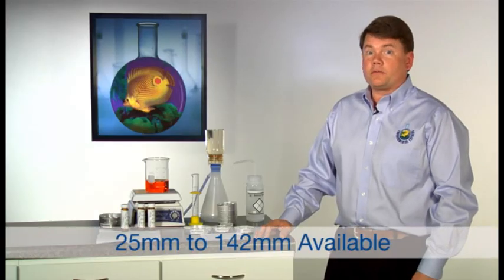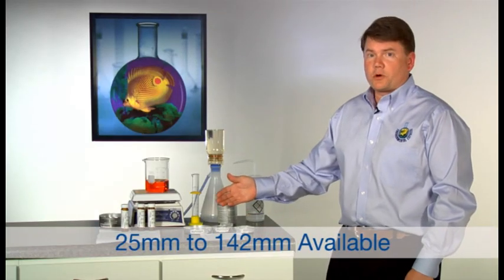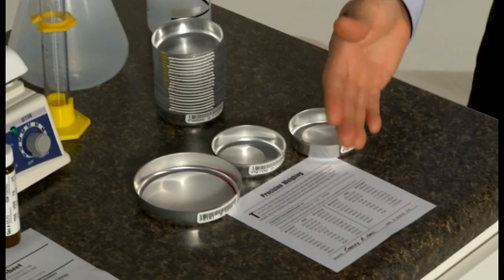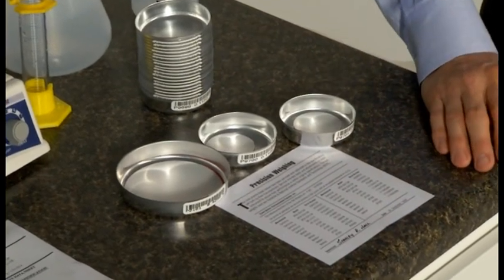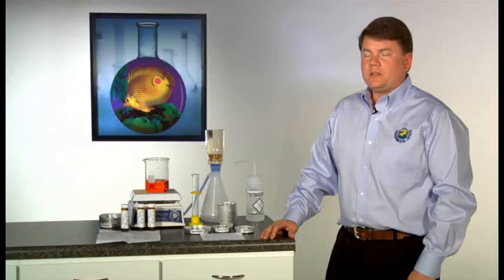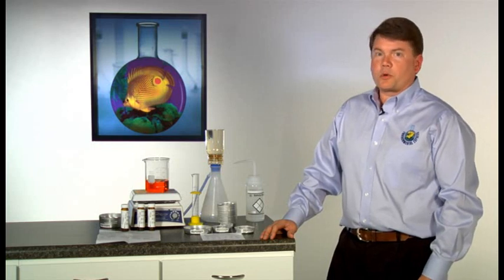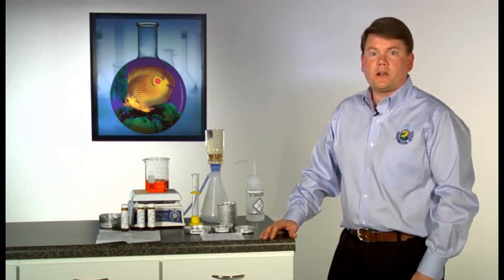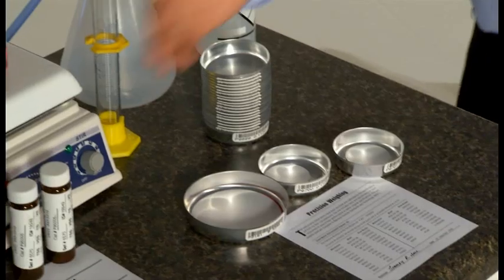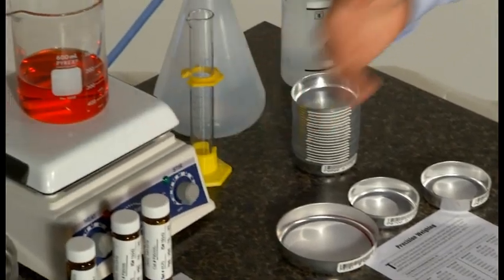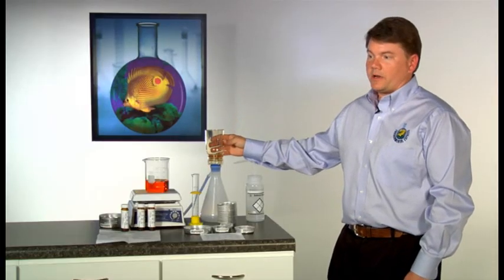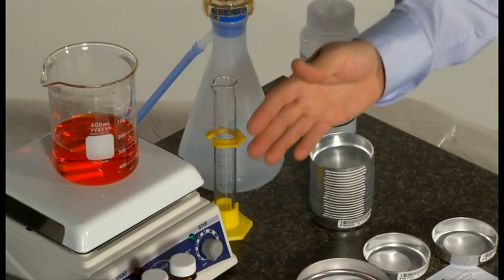Environmental Express is proud to offer a variety of sizes of ProWeigh filters. Each box comes standard with a balance calibration certificate. In addition, we also carry other products for total and volatile suspended solids, including the standard filtration apparatus and a stir plate.